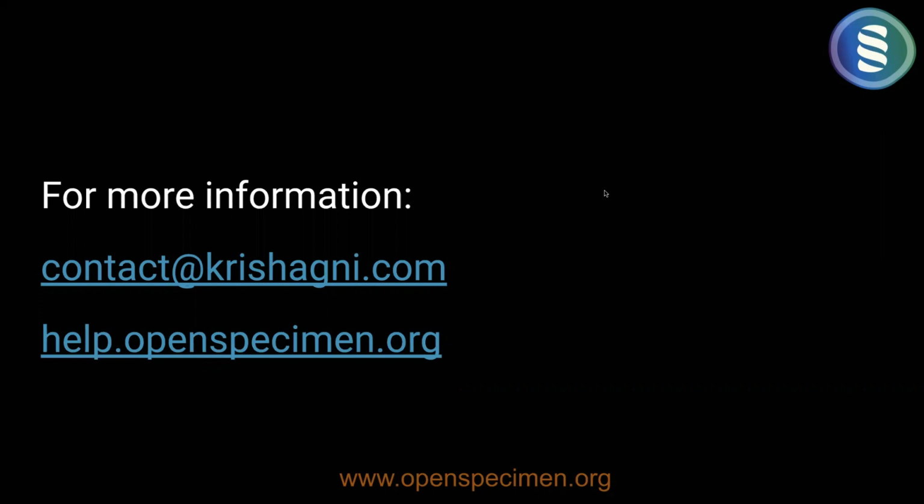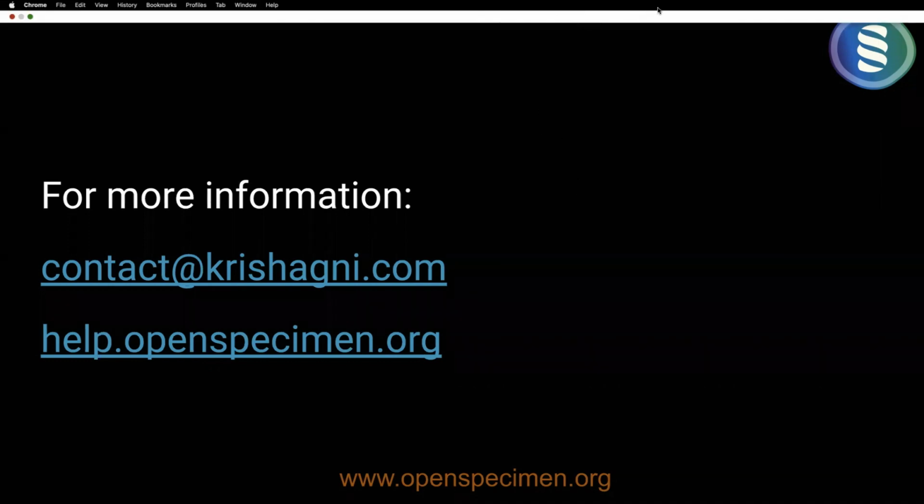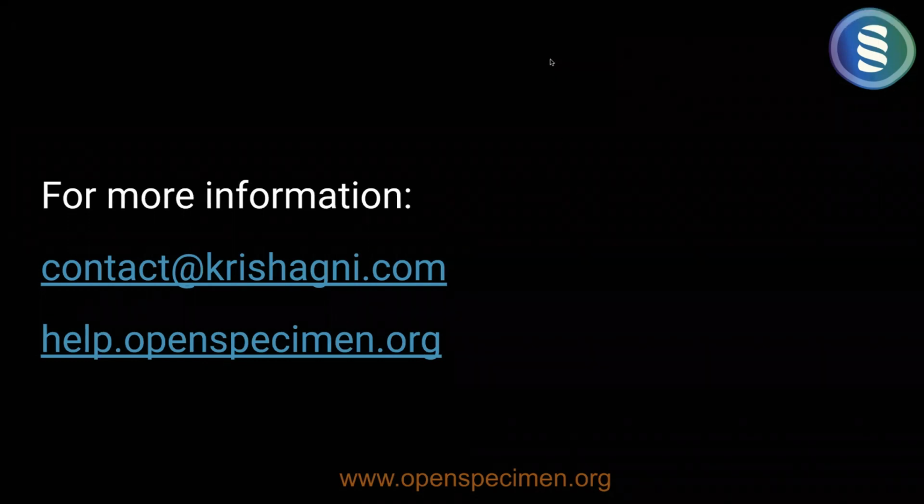We'll be happy to show you specifically how it works for you, and then discuss what things you would like to see in the mobile app if you had to use it in your biobank, etc. If there are any questions, I'll be happy to take them, or else we'll be sharing this video with you, and you can refer to it offline.